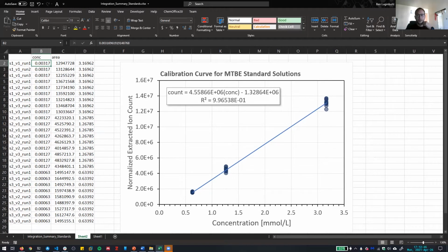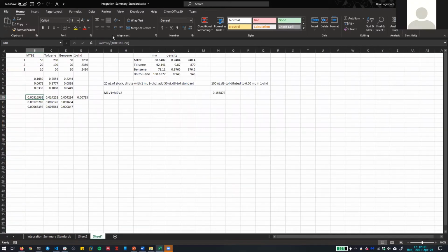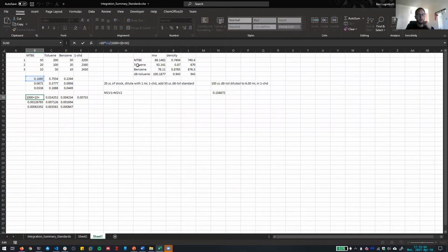So 10 should be a 20, says Brandon. So what is the 20 again? Can someone remind me from the actual calculation what that 20 is coming from? You're summing up the solution down there. So you've got, oh no. No, I can't remind you. Sorry. No worries. I was thinking that before last class, and then I saw it again, but I don't remember where it's coming from now. Yeah, so all of these, we're adding 10 microliters of something, or we must be anyways. Does someone have the lab handy? I can't remember off the top of my head.